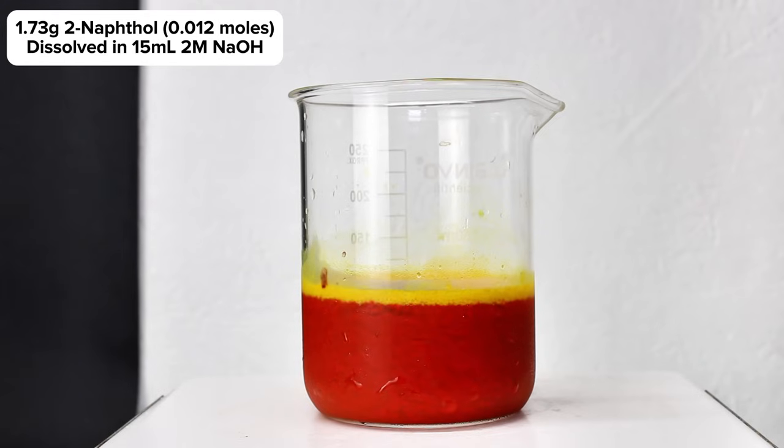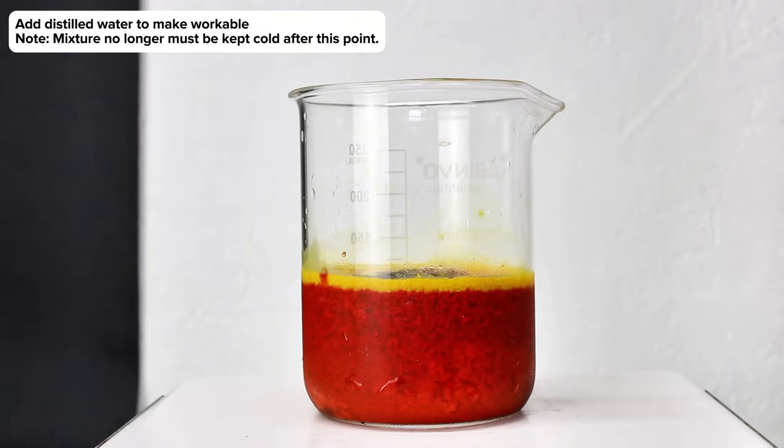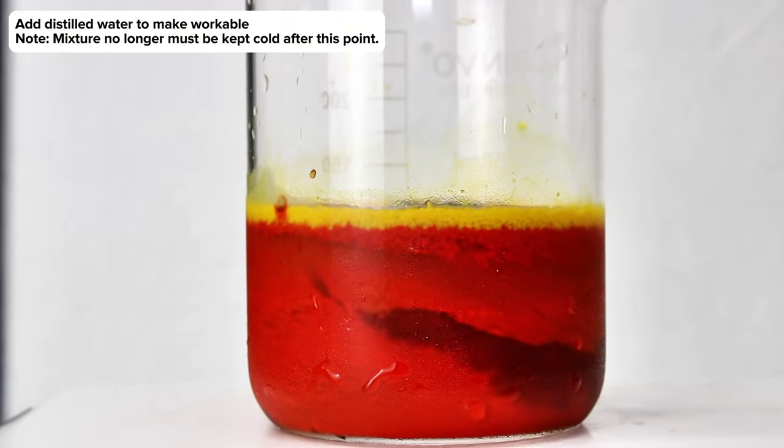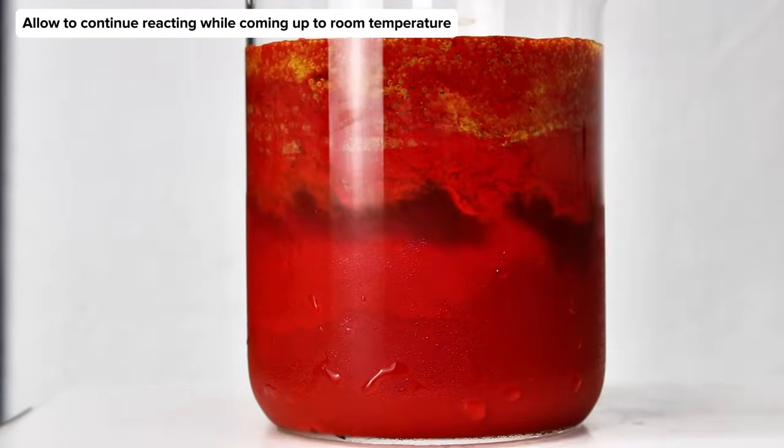The precipitate here is so dense that magnetic stirring quickly became useless, and to fix this I slowly added as much distilled water as I could without overfilling the beaker. This helped to get things moving again, and at this point I simply allowed the mixture to continue reacting at room temperature under constant stirring for a little over an hour.